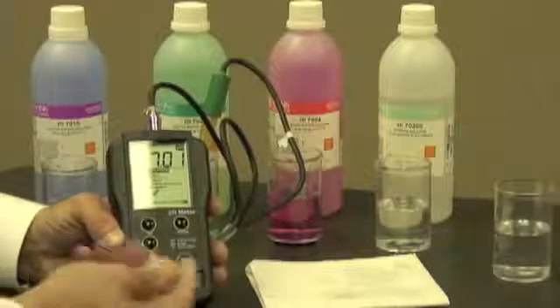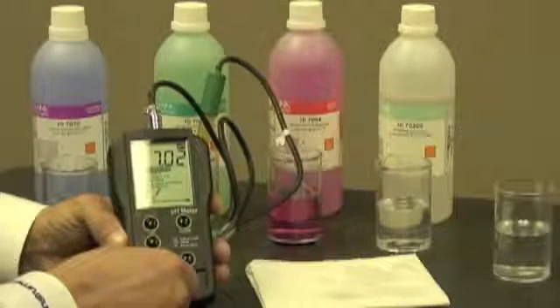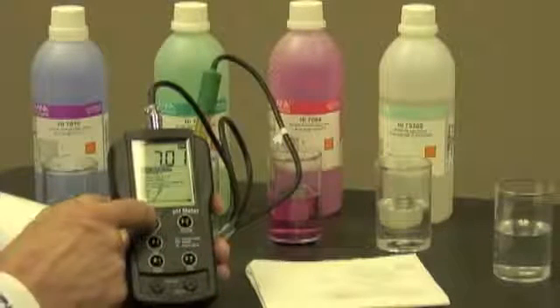I can turn the knob either with a screwdriver or a coin. I've gotten it to 7.01 — it went back to 7.02, so I gave it a little tweak and we're at 7.01. Now I'm going to push the pH button.